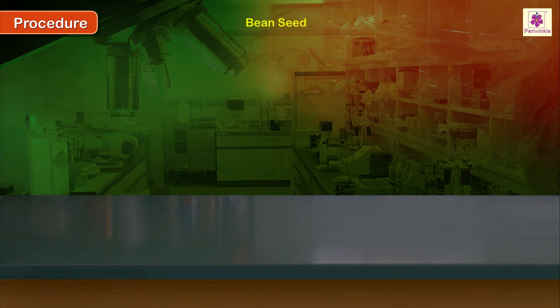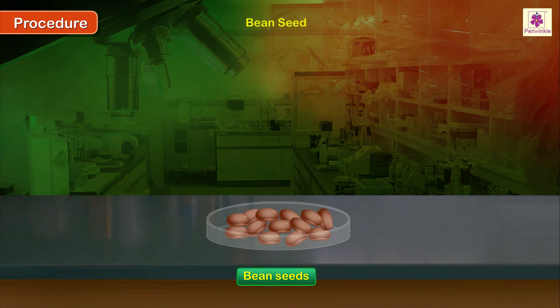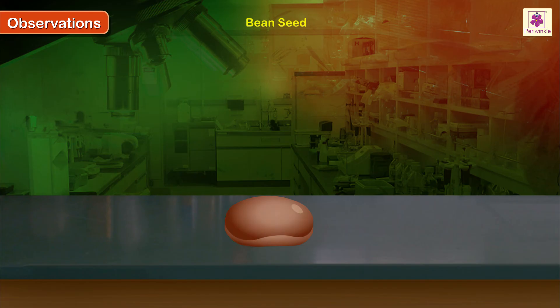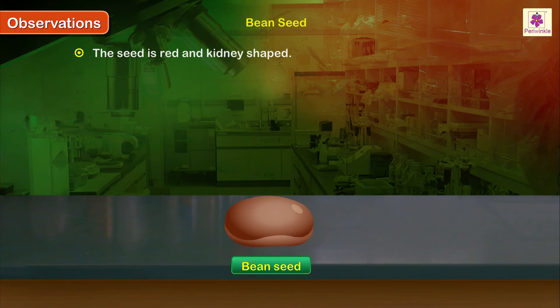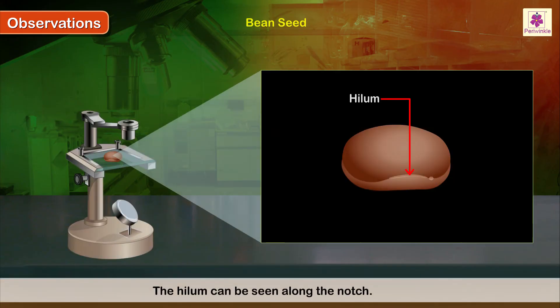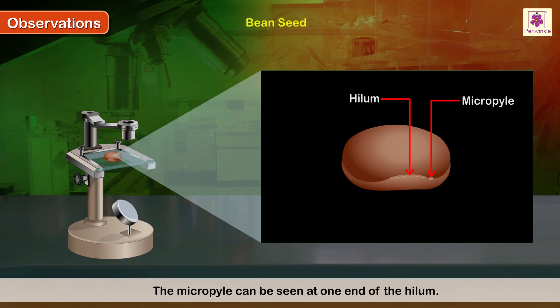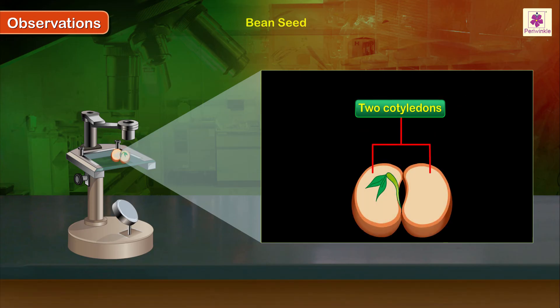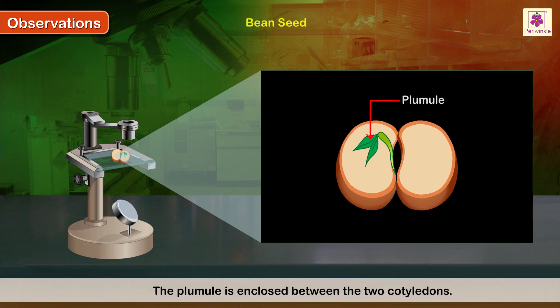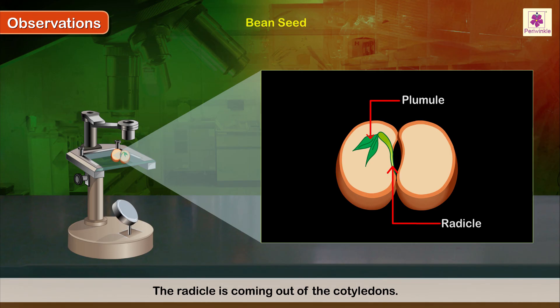Procedure: Repeat the same steps with the bean seed. Observations: the cotyledons are thick and fleshy. The plumule is enclosed between the two cotyledons. The radicle is coming out of the cotyledons. The hypocotyl can be seen easily.